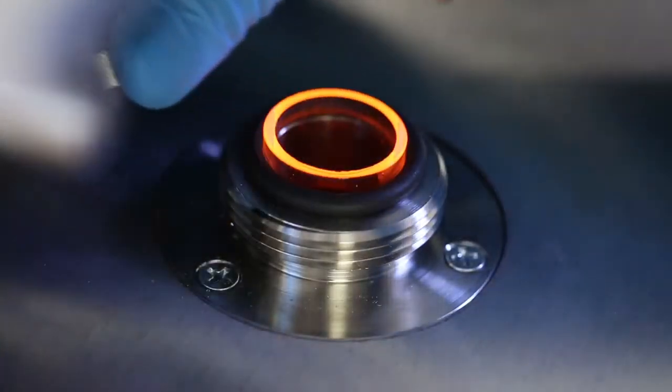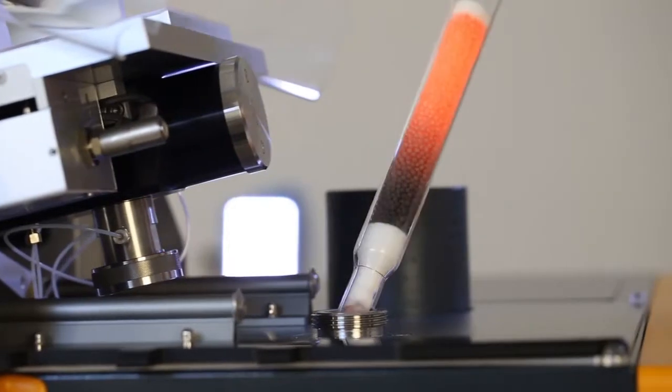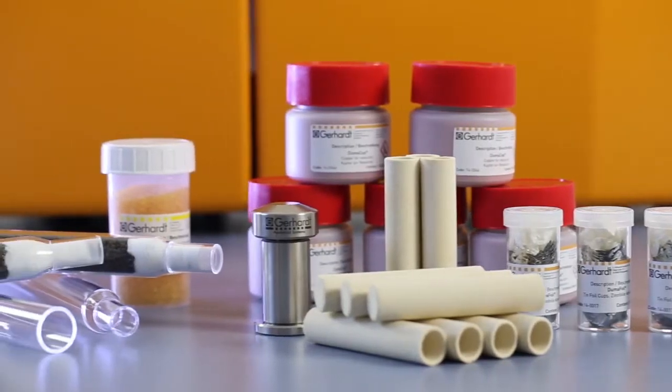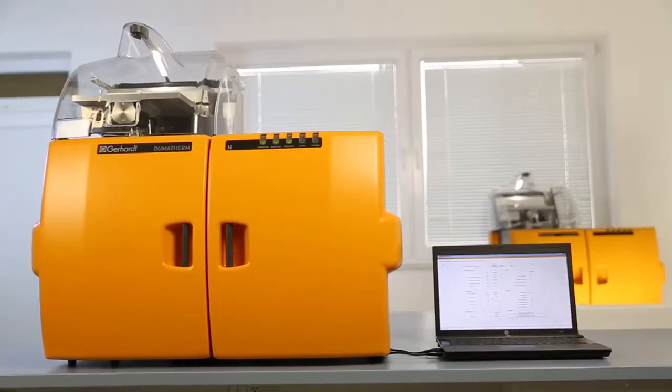The reactors can also be exchanged quickly whilst at operating temperature. C. Gerhardt provides full service for the Dumatham system, with consumables and service packages optimally tailored to your needs.